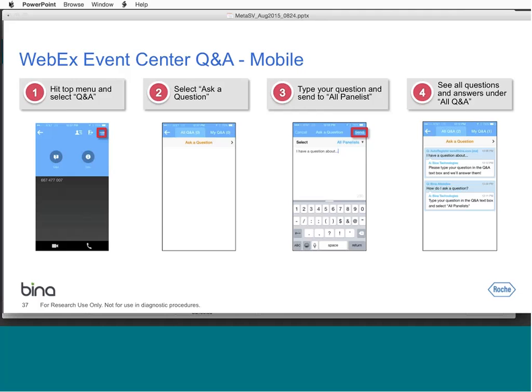Our first question: what happens when only one tool is selected on the RAVE UI? Why don't you need at least two tools for MetaSV to run in the back end? That's a good question. As I mentioned earlier, even if you use a single tool, it might still make duplicate SV calls, which are roughly at the same location but reported as distinct SVs. First of all, MetaSV will remove those duplicates to make sure there are fewer false positives.